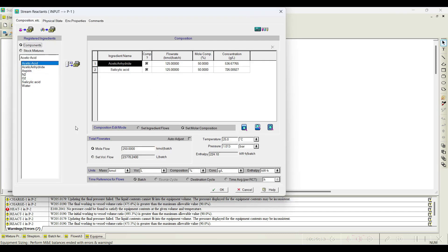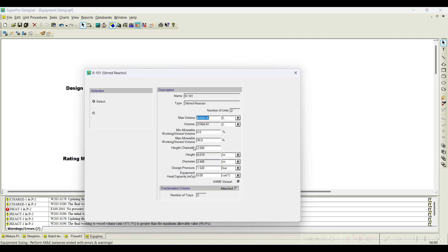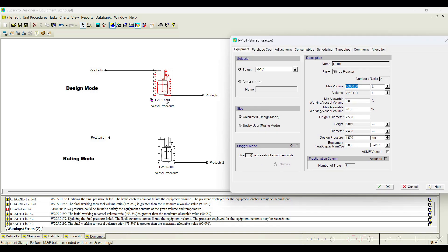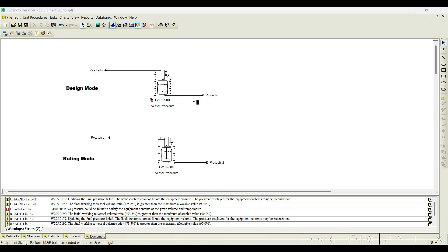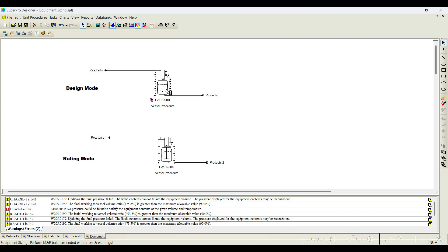If I change the input to 5,500 kilomoles per batch and simulate, the multiple-equipment symbol appears. Going to equipment data, with the flow rate increased the required volume exceeds 40,000 liters — the product stream shows almost 60,000 kg per batch, which is about 47,000 liters. Since 47,000 liters exceeds the 40,000-liter maximum, one reactor cannot carry out the process, so the software automatically assigns two reactors.